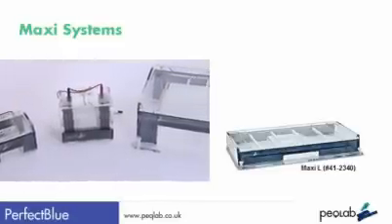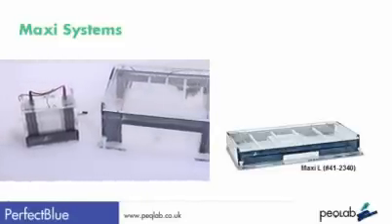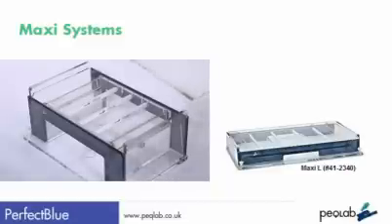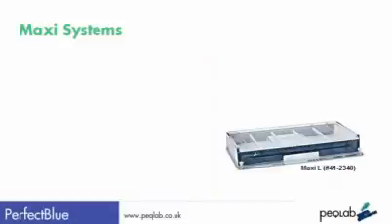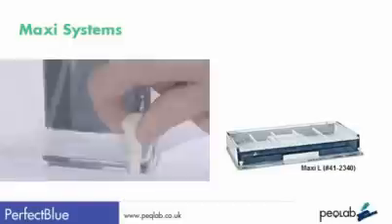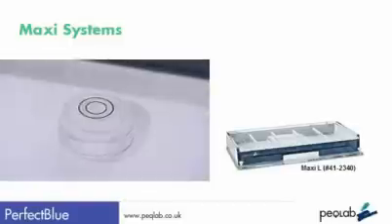PECLAB's Perfect Blue MaxiGel systems have quality built into every part of them, and are designed for the serious researcher who recognises the value of straight, dependable separations from high-throughput sample numbers. Each Maxi system is provided with combs, lid, gel tray, end gates for gel pouring, cables, and also a three-point levelling platform as standard.